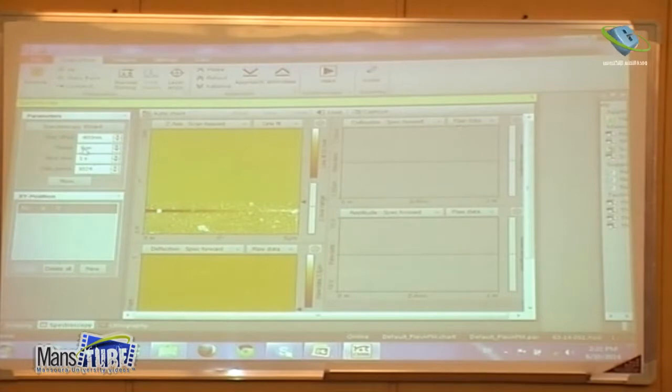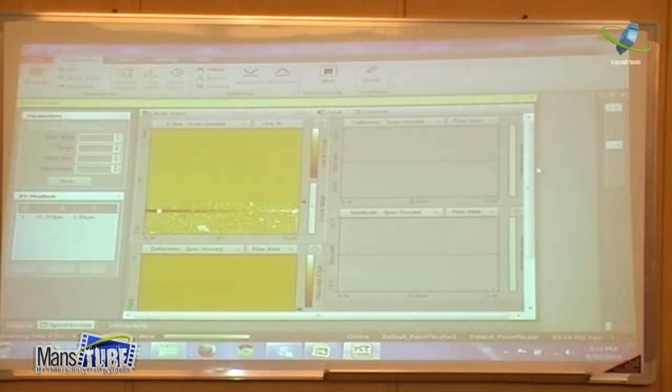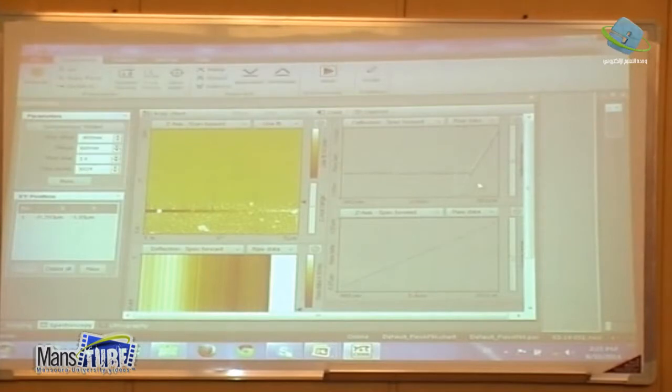Let's say I will put here the same value, 600 nanometer, and let's say you have 1 second per line and 1,000 points for one spectra. You can make 10,000, I think, with one spectra. Let's say I take 1 point here, and then I make start. Now you see, this is the spectroscopy here.